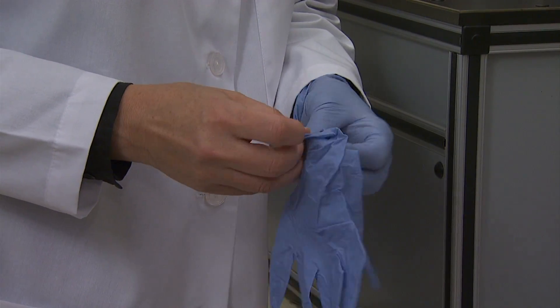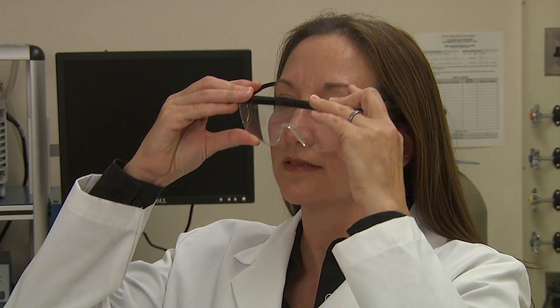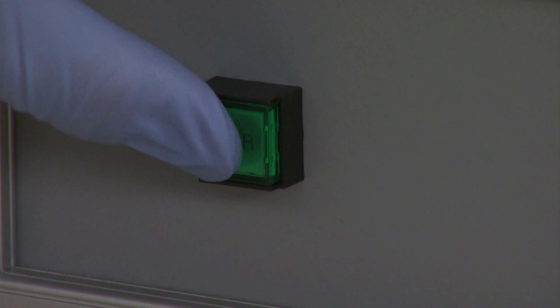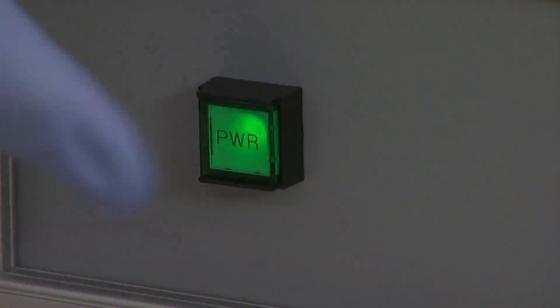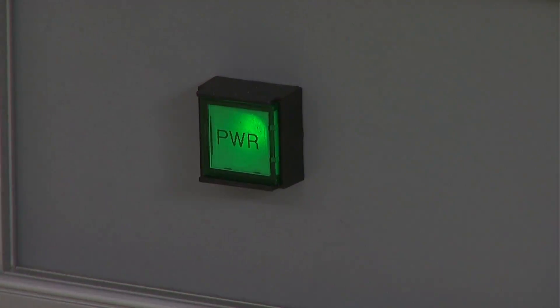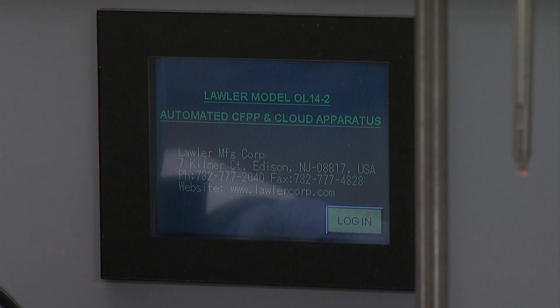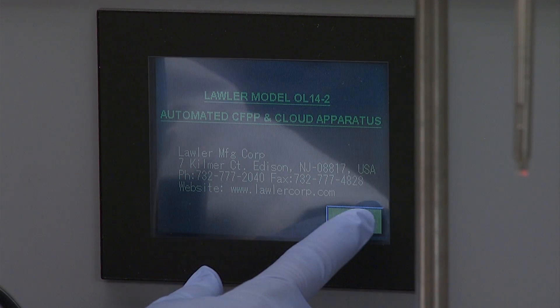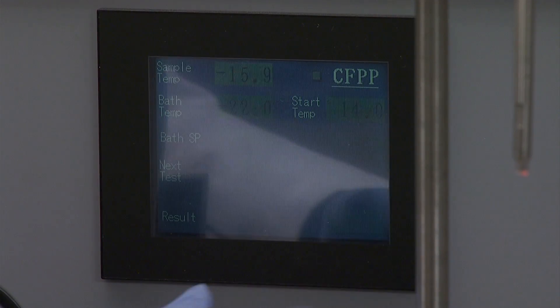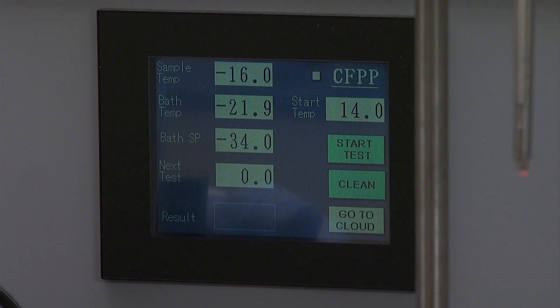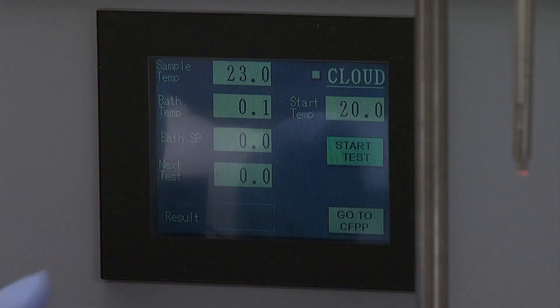Solvents for cleaning include petroleum ether or toluene and acetone. Protective equipment includes gloves, safety eyewear, and a lab coat or apron. Turn on the instrument and allow the refrigeration unit of the bath to equilibrate for at least 15 minutes. On the display screen, touch the option that reads Login, then press Go to Cloud.